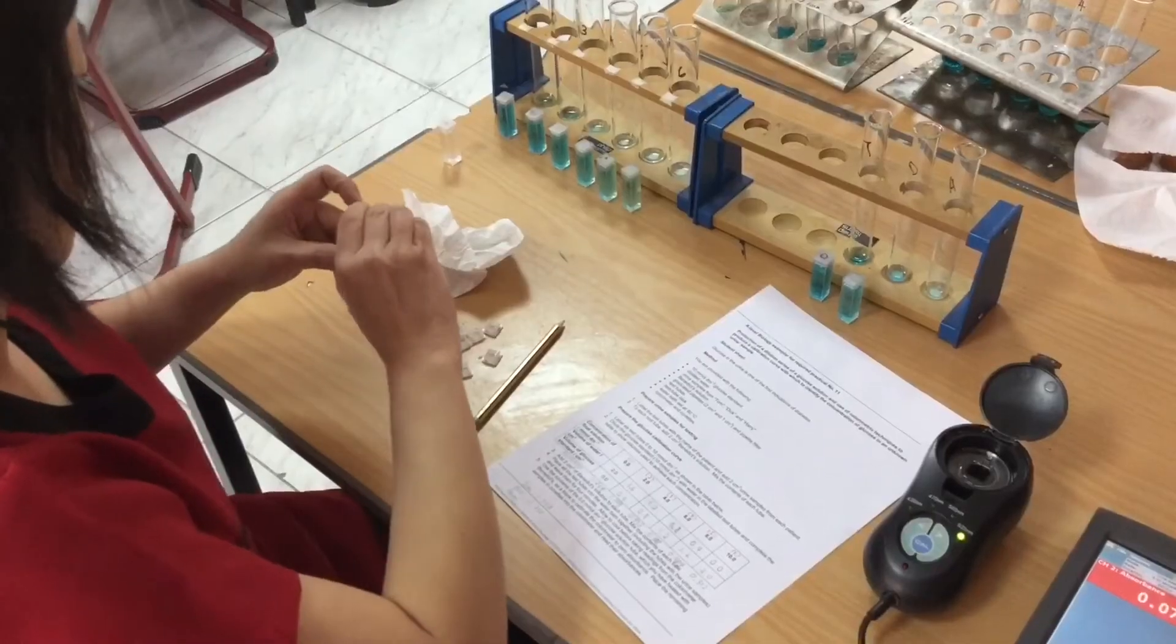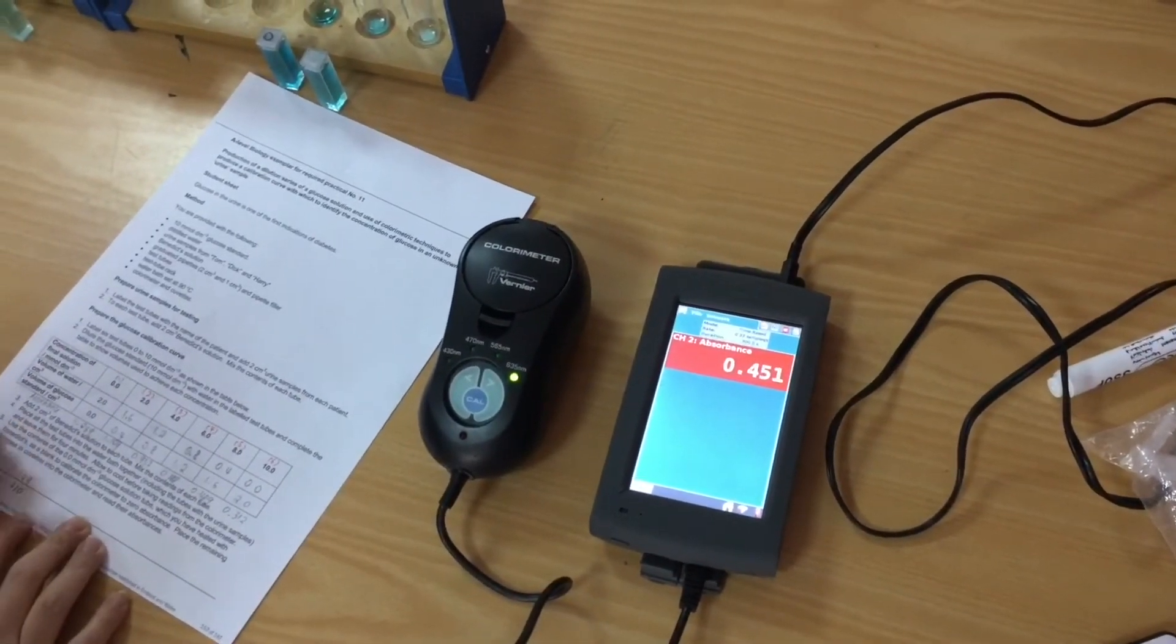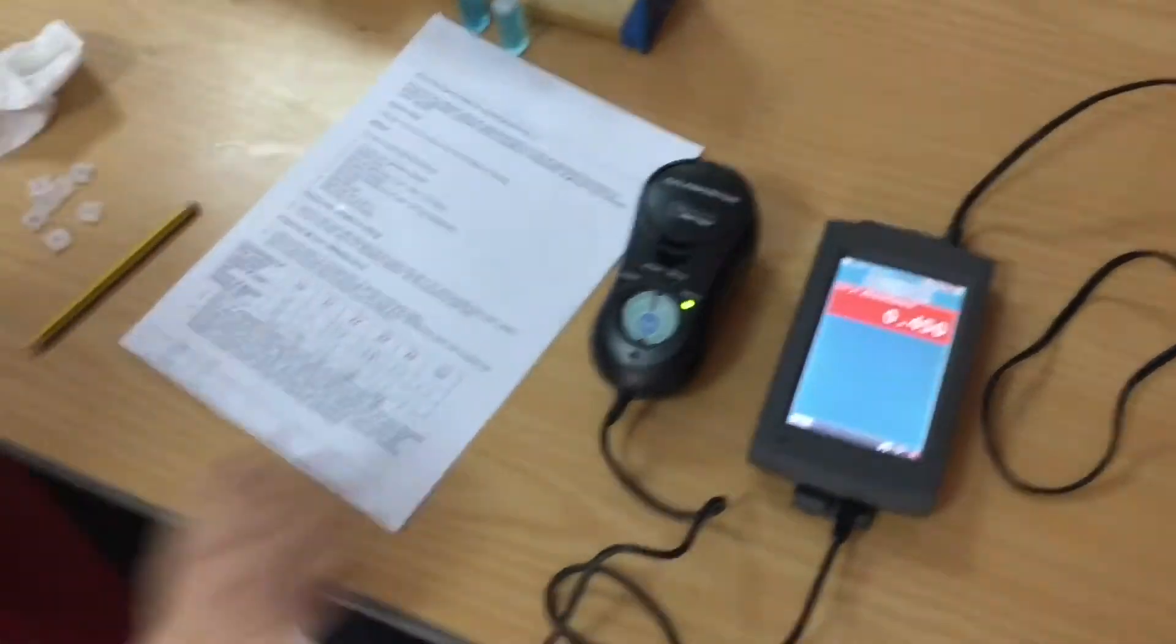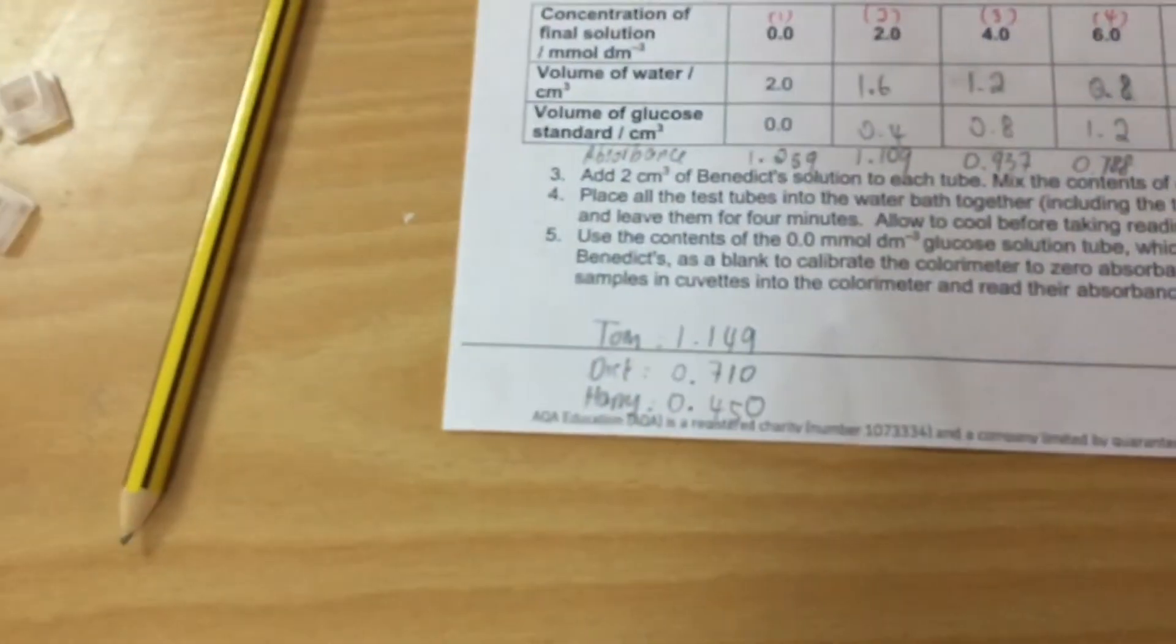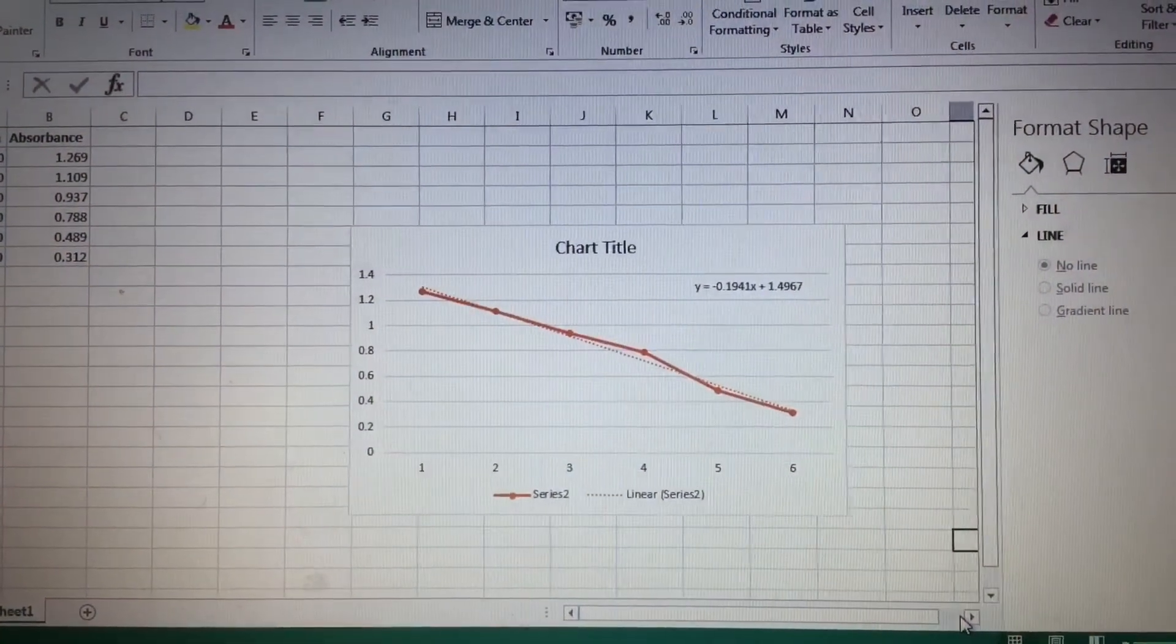I then move on to find the glucose concentration of the urine samples of Tom, Dick and Harry using the same method, measuring the absorbance and then reading off from the graph.